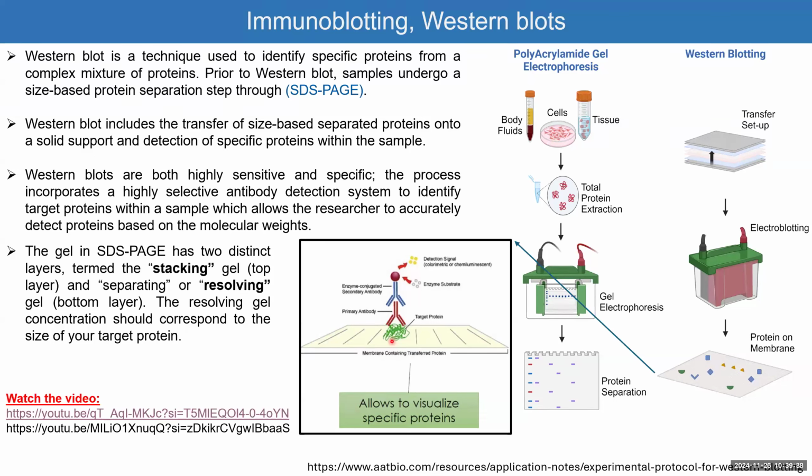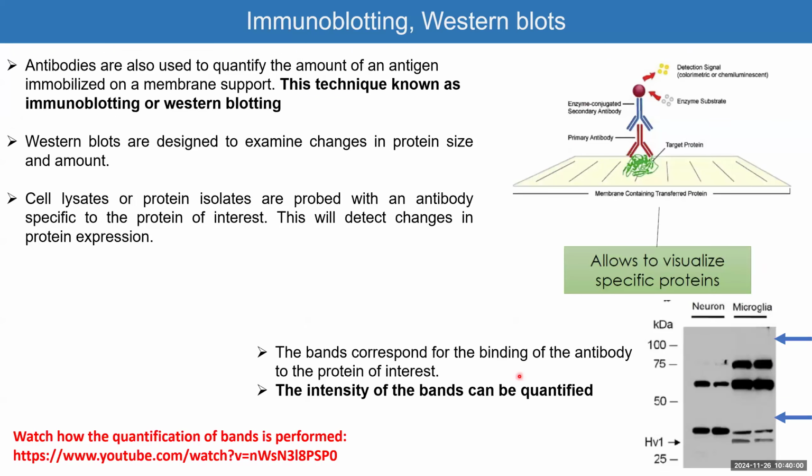I should know the antibody binds to which epitope on those proteins, stuff like that. So I have an estimate on where those proteins should be. Is it in the 20 kilodalton area, or the 50 kilodalton area, or the 100 kilodalton area, right? So it's important to have that.